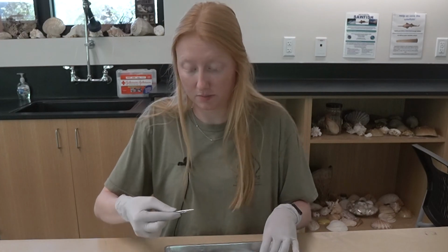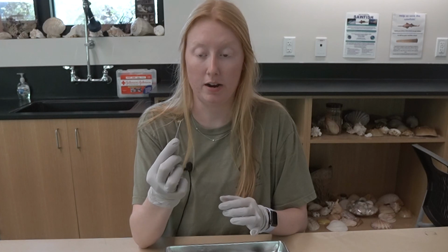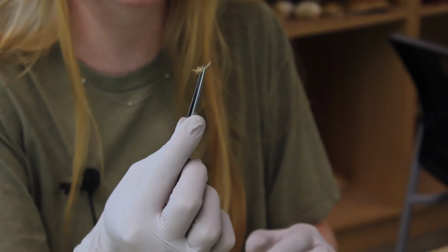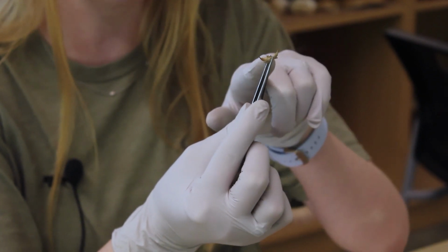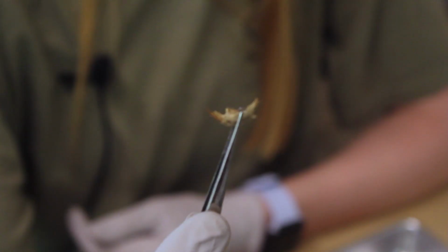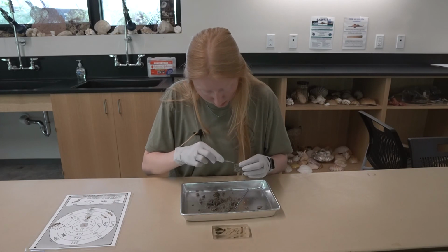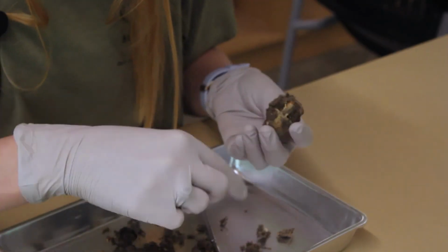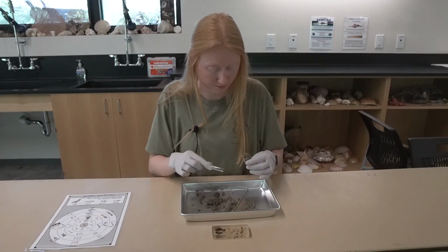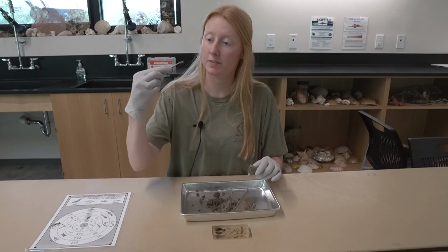So this is going to be the bottom jaw of the animal that we're trying to get out right now. So a rodent, because it's got that big orange tooth right there. And if you look super, super close behind that orange tooth, you can see all of the itty bitty teeth behind that one, since even though this was a bigger rodent, it still has very tiny teeth. There's the other half of that same bottom jaw right there. It's again the orange tooth.